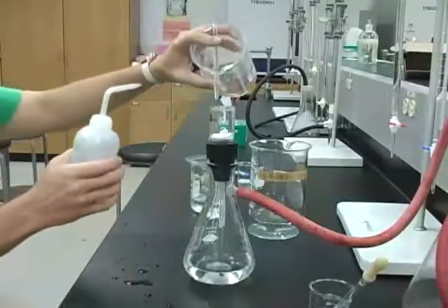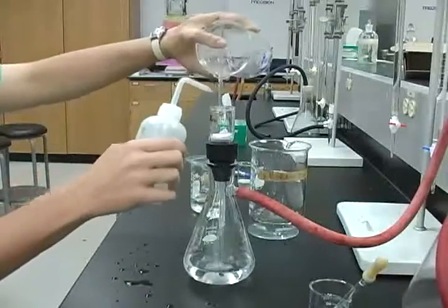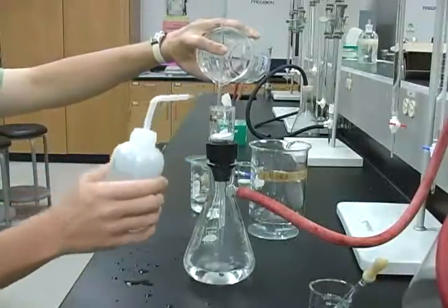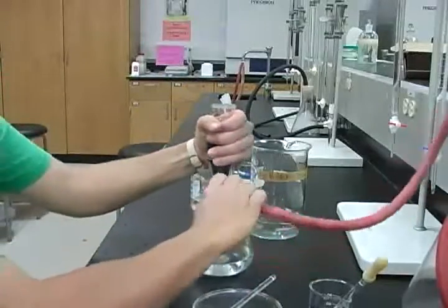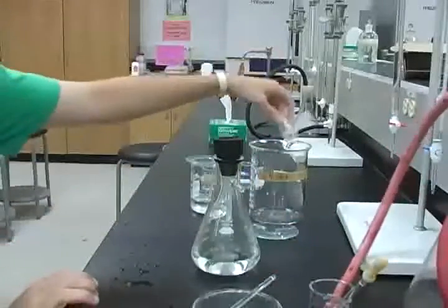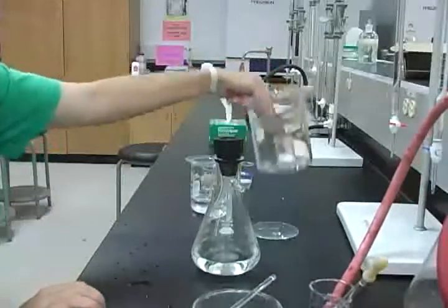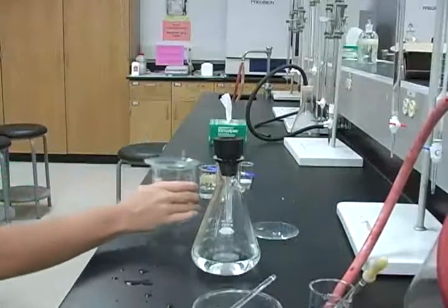After all of the precipitate solids are removed completely from the beaker and the stirring rod completely rinsed off, you will transfer this sample into your liter beaker. Keep that sample in the dark until all 4 samples have been filtered. At this point, you would move on to the next sample.